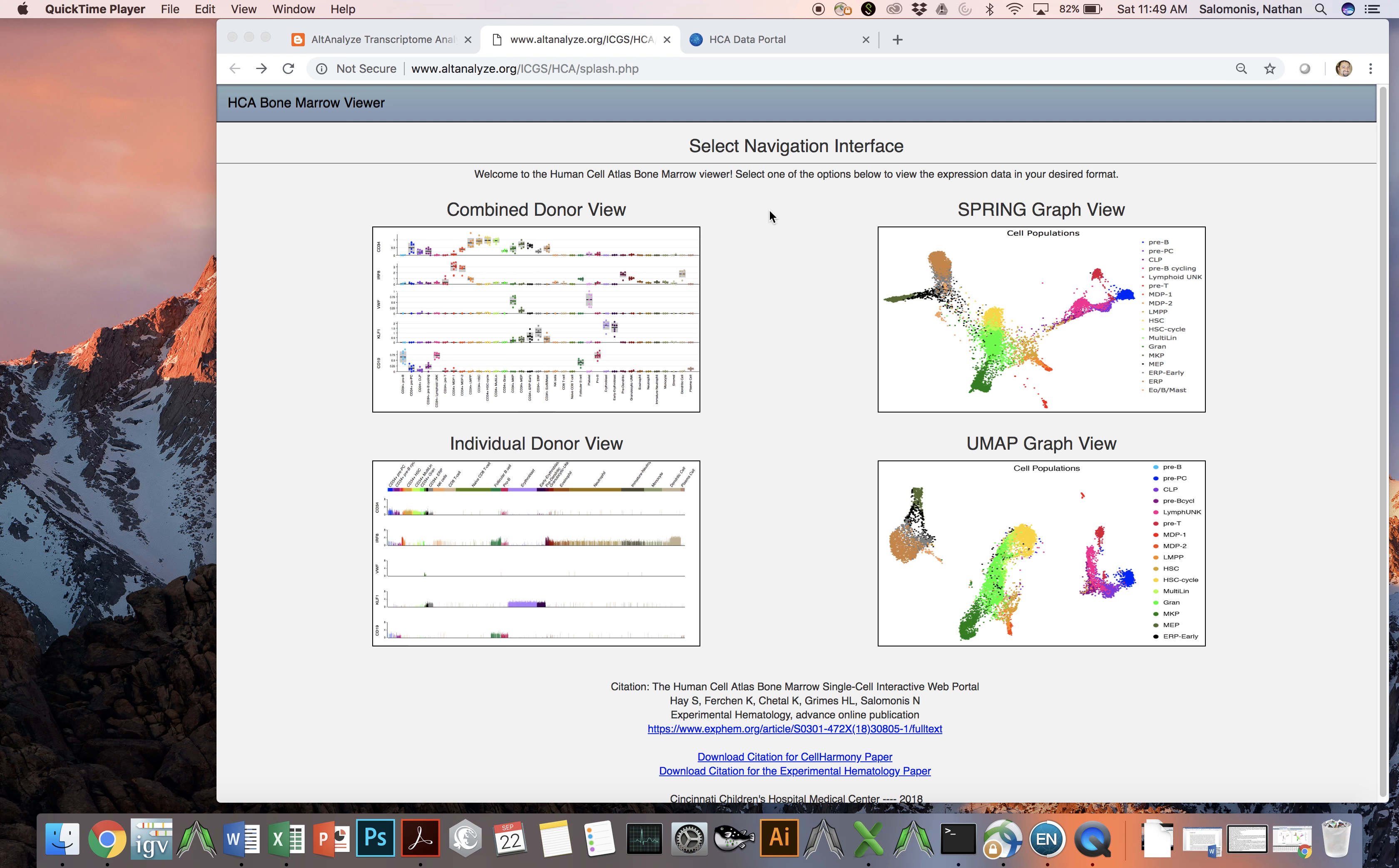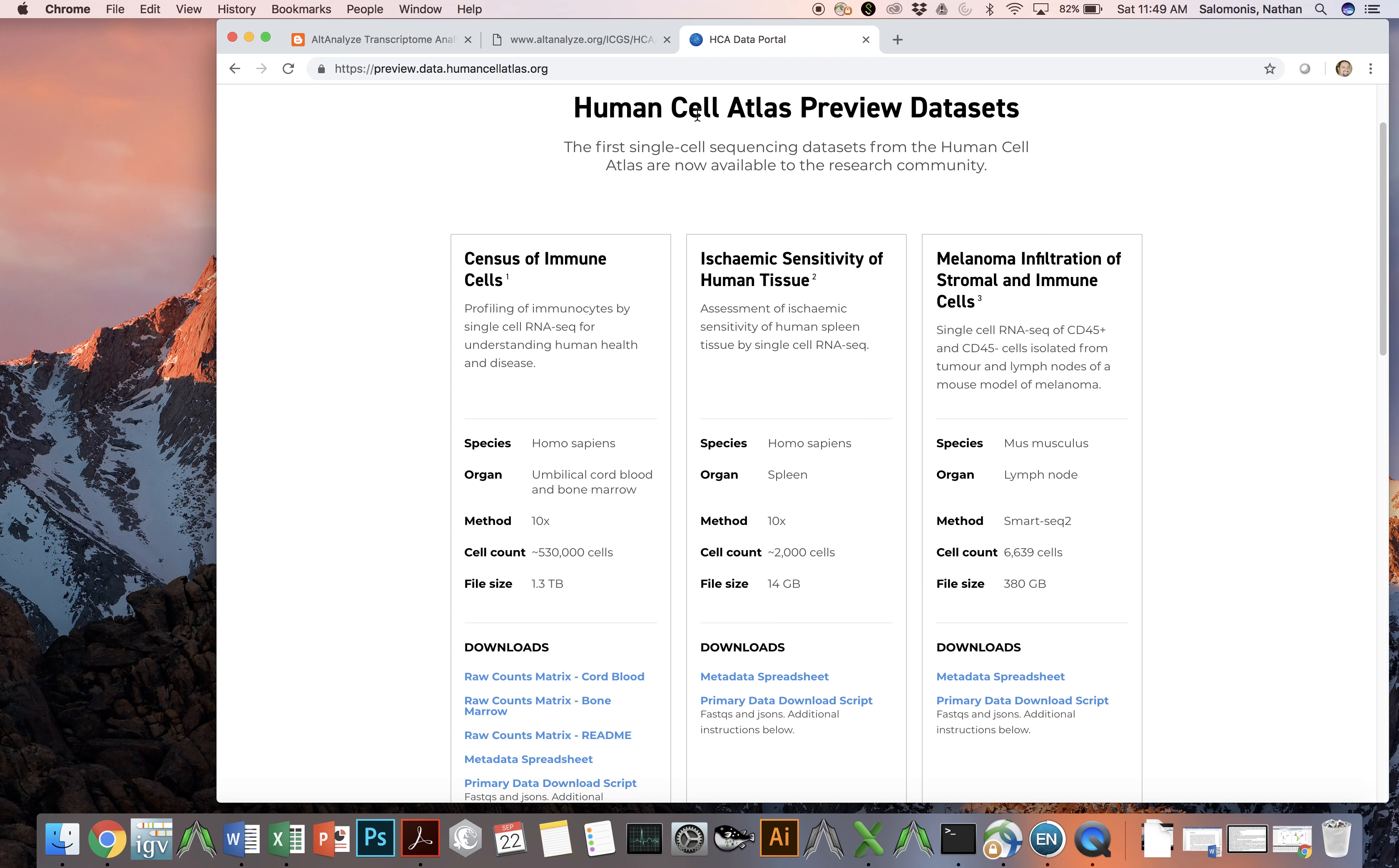These data were obtained from the Human Cell Atlas Preview Datasets Viewer, in particular a census of immune cells, which includes both umbilical cord and bone marrow RNA sequencing data, collected initially for 530,000 cells.